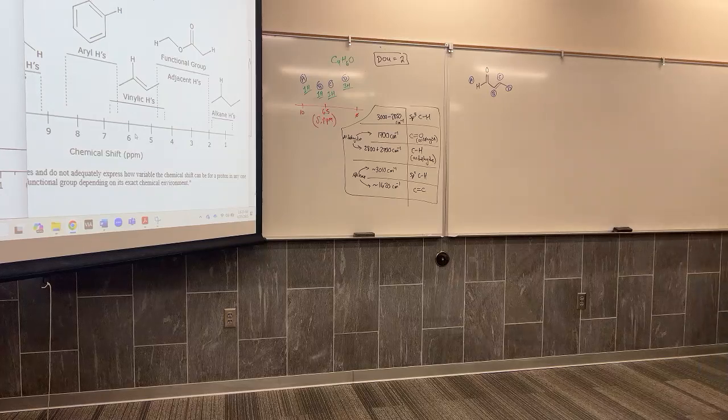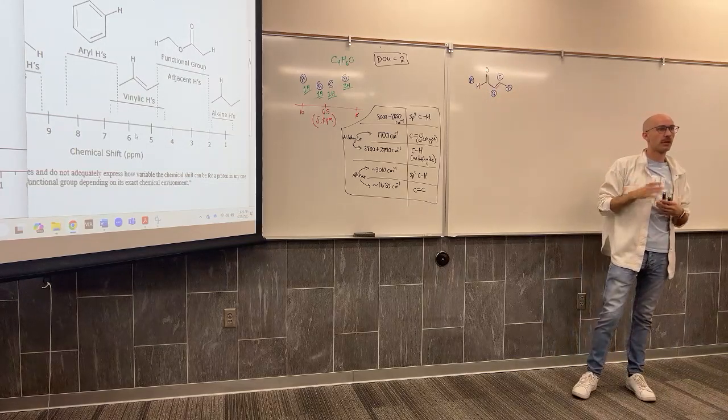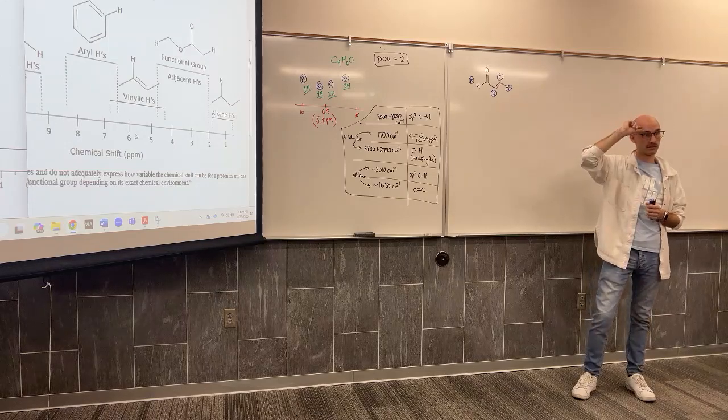Sorry? No, you do not have to do this labeling on the test. But this is just our way of confirming the integrations match up.